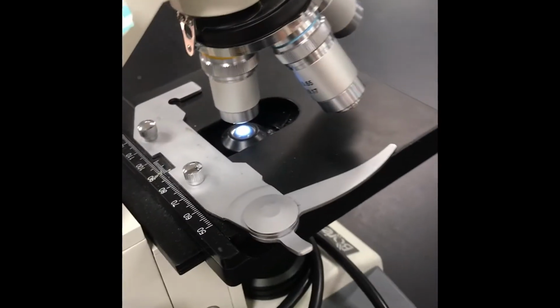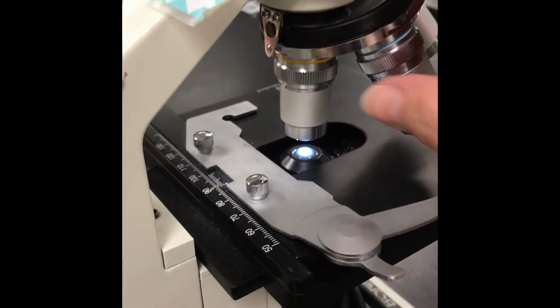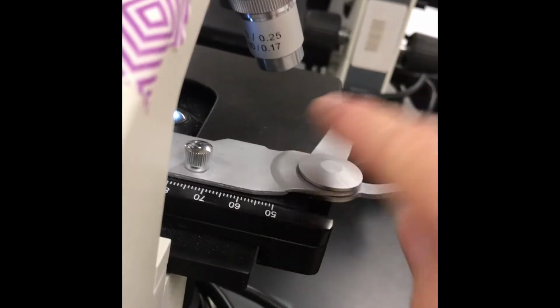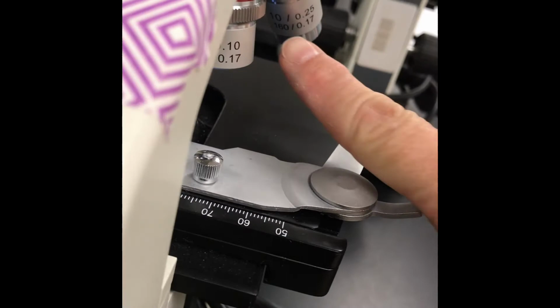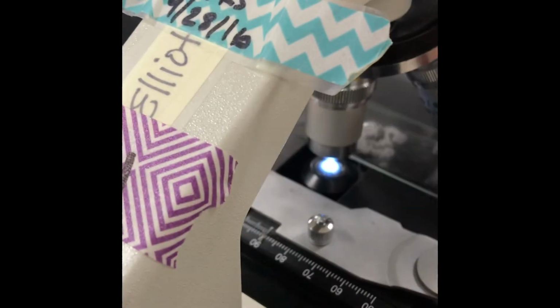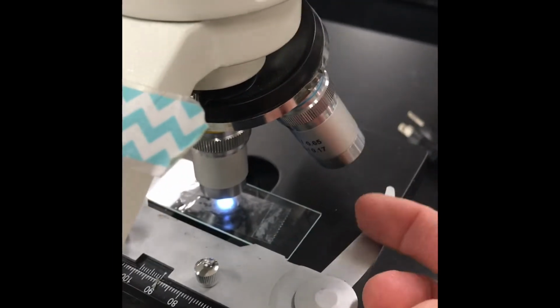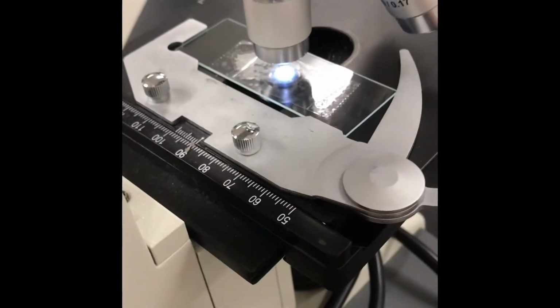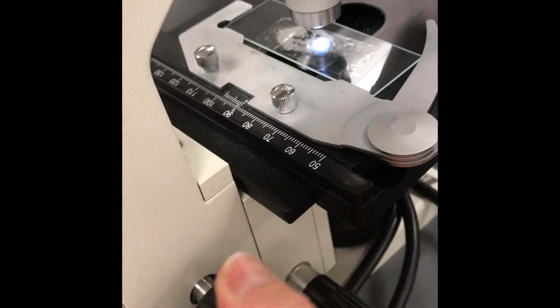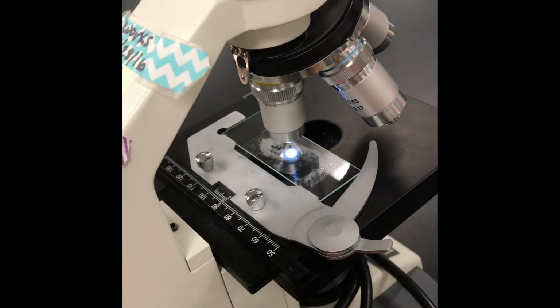So we're gonna take our first slide, this is Rose, and we're going to examine it under the microscope. The first thing we wanna do is make sure this is on low power. It's the yellow objective and it's 10x. You can see on this side, I can zoom in right here. It's got a 10 right there, it's 10x. So we're gonna put this on the stage. Use our stage clip, there we go. I'm gonna put the stage all the way down and look through the ocular lens and raise the stage up until it comes into view.